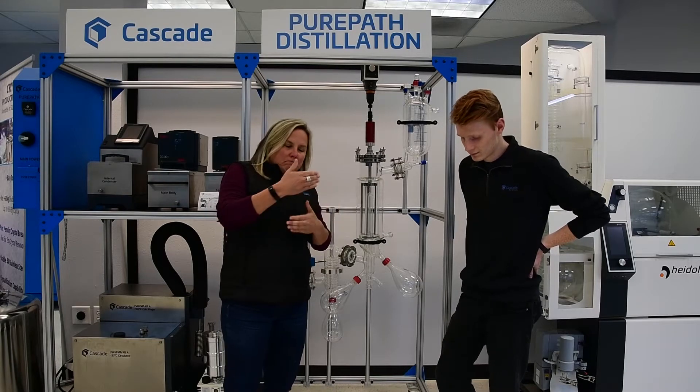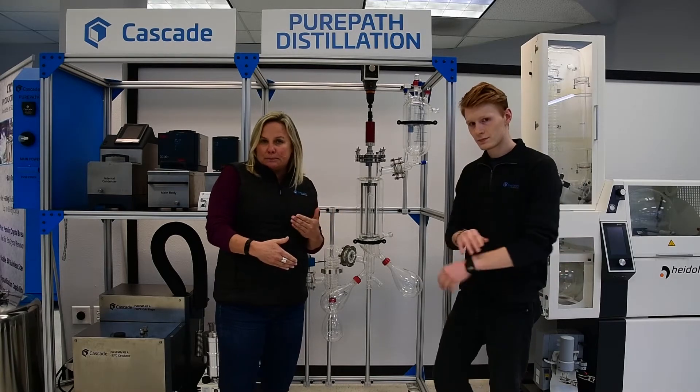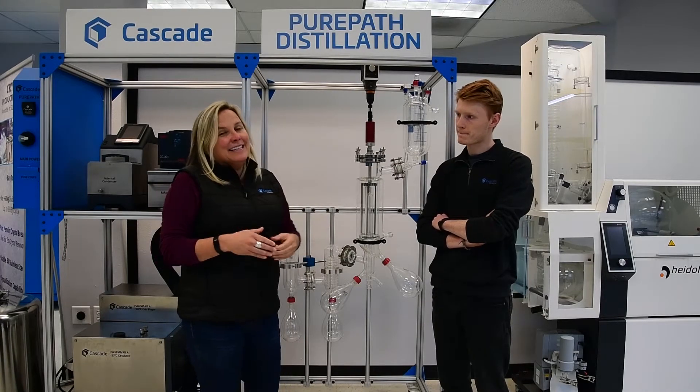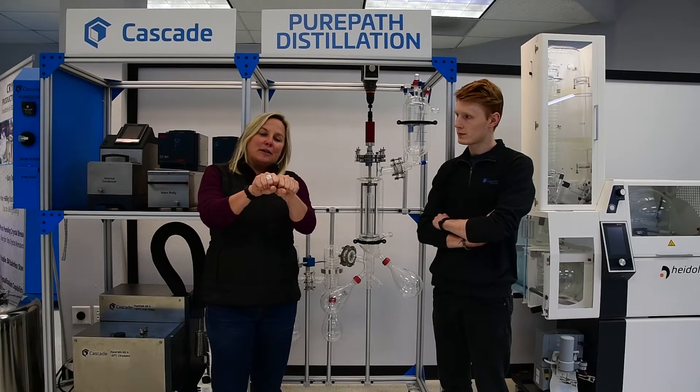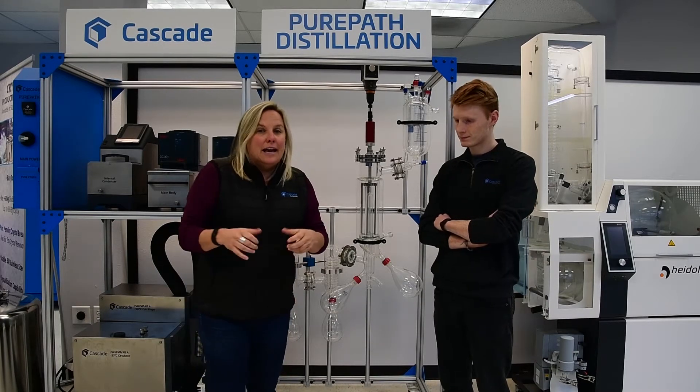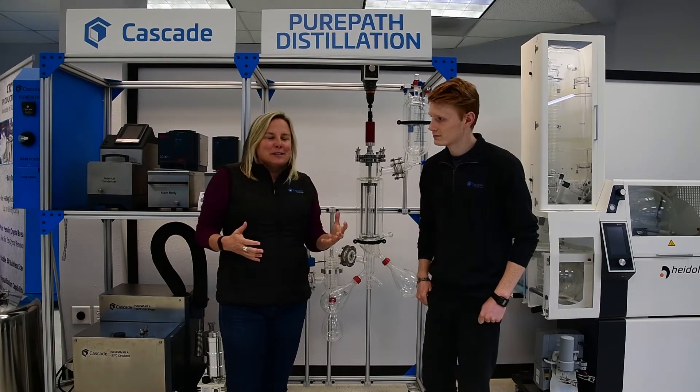The depth of vacuum gives you a better distillation process altogether. But what I really like, and one of the reasons why we've chosen this glass, is it's so high quality and the vacuum integrity is so good that the joints can be greaseless.